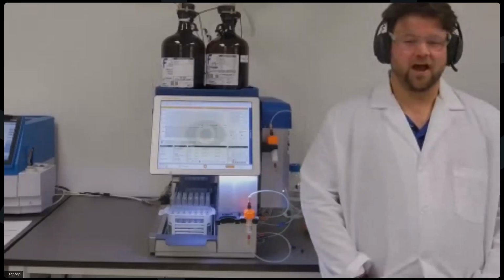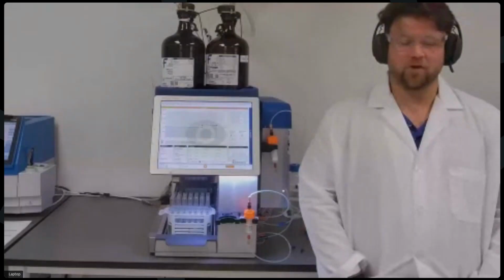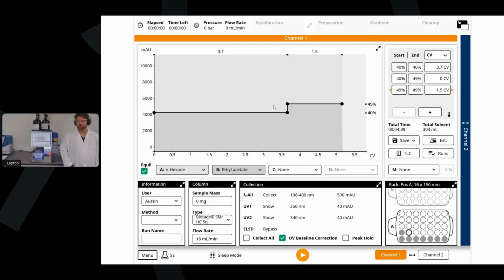Awesome, yeah. Something that I wish I had in grad school, absolutely. Learning chromatography as a bench chemist is definitely not something that's that easy to grasp when you're first starting out. But that TLC to gradient feature definitely saves time in creating those gradients. We do have a standard gradient format from that algorithm. We do try to elute those compounds in about 10 column volumes. But yes, absolutely, using that TLC to gradient feature is one of my favorites.